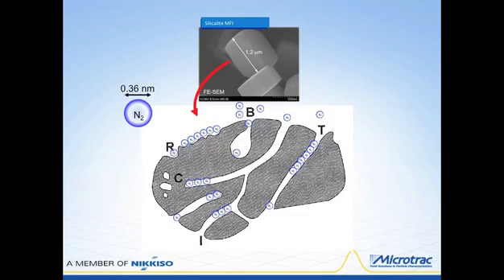Now we have this particle up here. This is a silicalite MFI, and this material, when we look at it under SEM, just like our Earth from space, we see that this particle looks very, very smooth, has no particular features associated with it, and looks like Earth from a long, long, long way away. But actually this particle does have a lot of structure. Now I've drawn a nitrogen molecule over here, and this is a diatomic molecule.